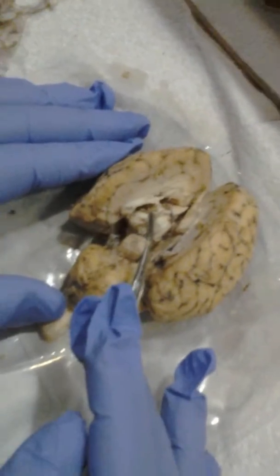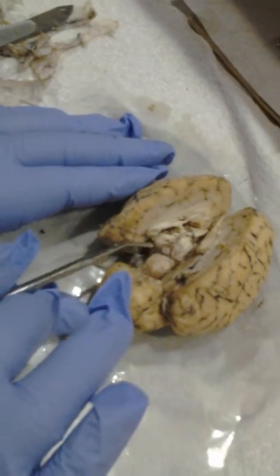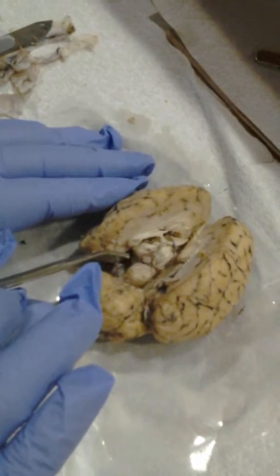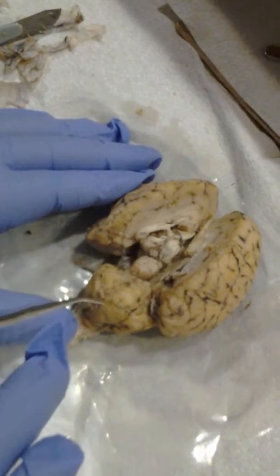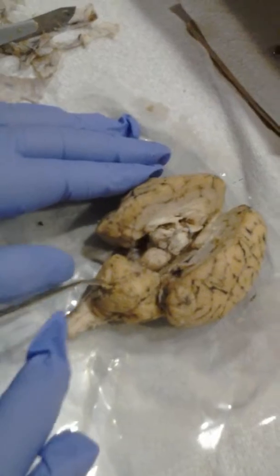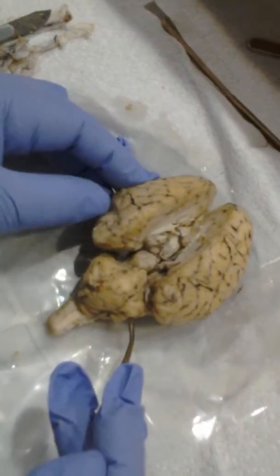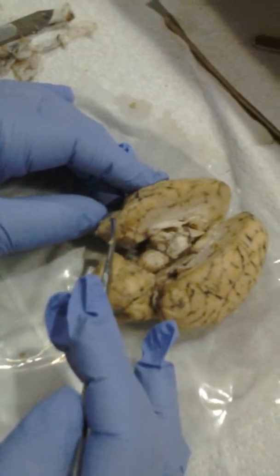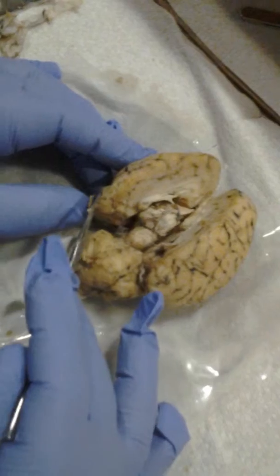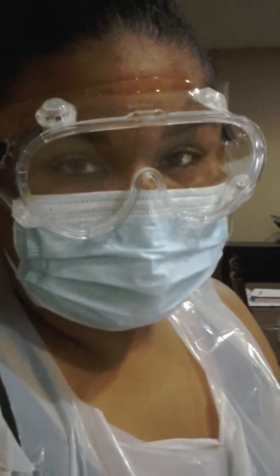Okay, here we have the pineal gland, the superior colliculi, the inferior colliculi, the vermis, the left lateral lobe, right lateral lobe. Here we have the corpora quadrigemina. And that's the conclusion to the structures of the sheep brain.